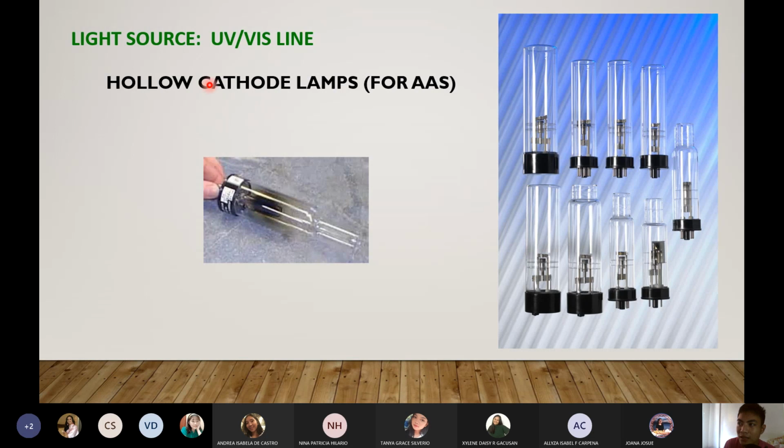So next one, we have the hollow cathode tube. Apparently, itong picture na to ay sira na. Okay. So ito medyo mura lang to eh. 5 digits lang din yan. So hollow cathode tube or hollow cathode lamp, HCL, tawag namin dyan. Ganon din. Instead of mercury, it has gas, no? Gas vapor ng atoms, no? Anong atoms? Ng elements na gusto mo i-measure.